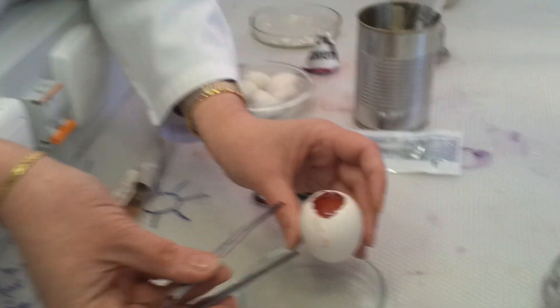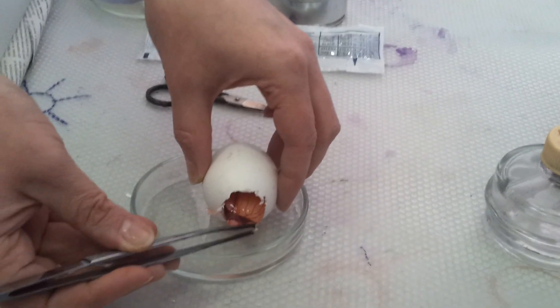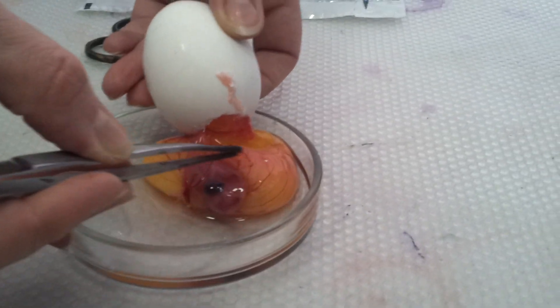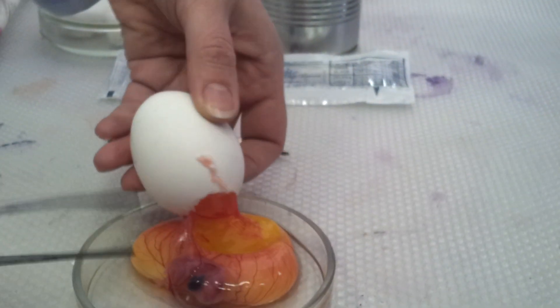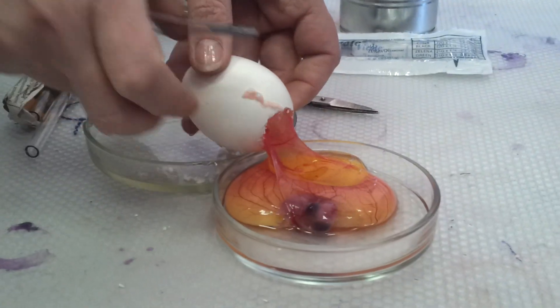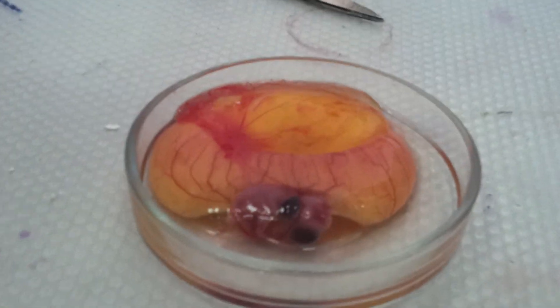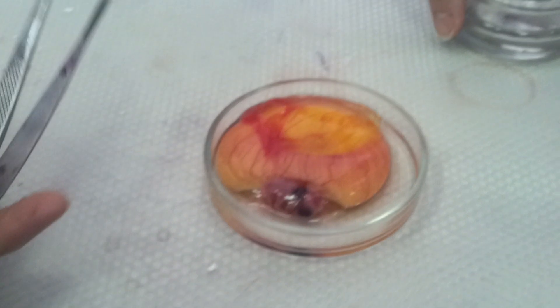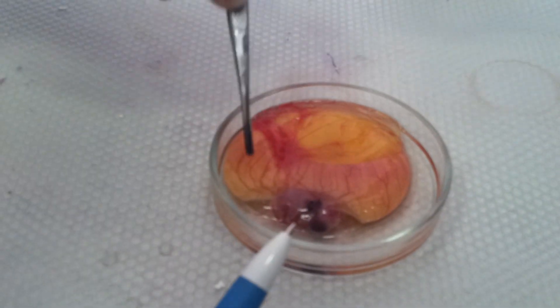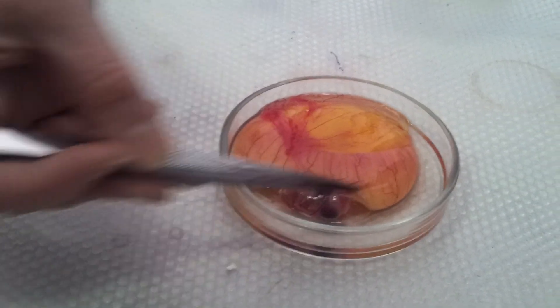Now I'll put it over here. You will pay attention to the cavities. You see the membrane? This is the yolk sac. Over here is the amniotic cavity and the body inside, with a very large eye. I'll put it carefully so as not to break the cavities. The allantoic cavity is destroyed — that's why the fluid is now in the petri dish. Over here is the yolk sac.